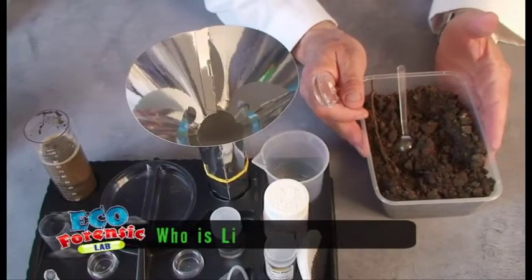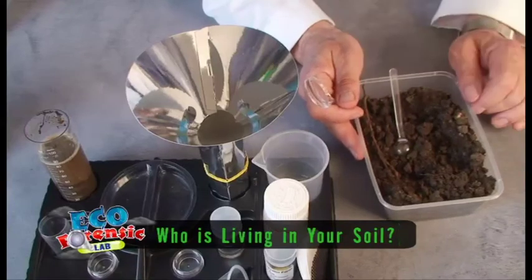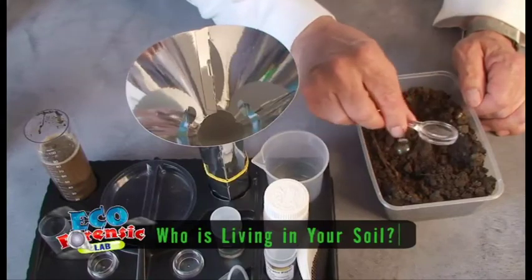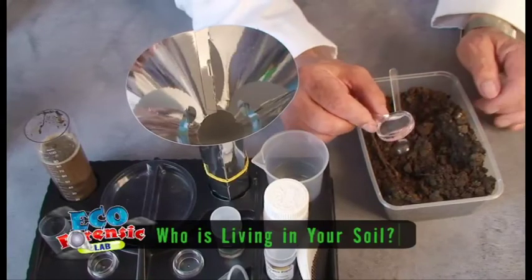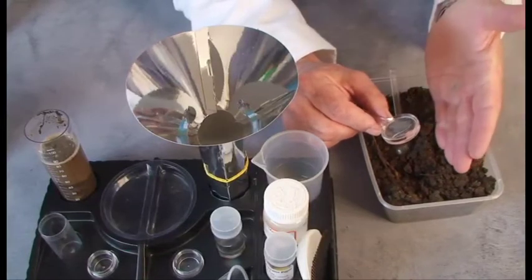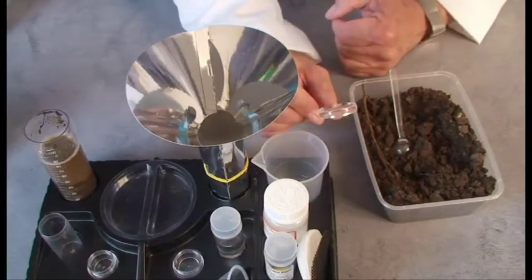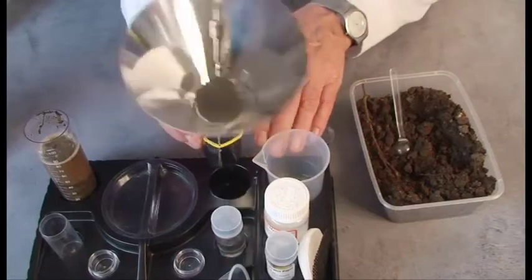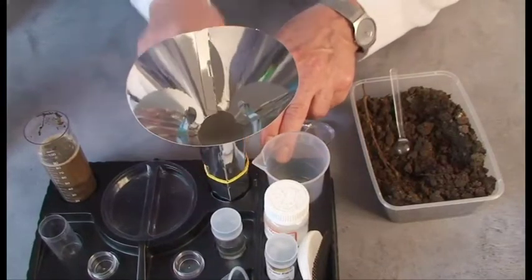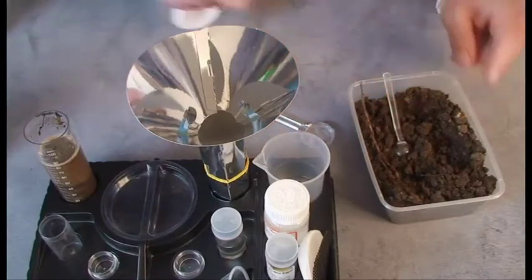The next test we're going to do is to find out what tiny animals are living in this soil — this will tell us how healthy the soil is. We can use the magnifying glass to look for the animals, but it's very hard to see them because they're buried in the soil. The answer is this: a Burlesi-Tulgren funnel. There are two of them in this kit, so you can test two soil samples at the same time.